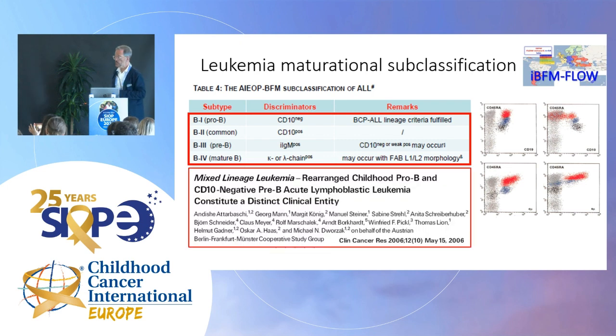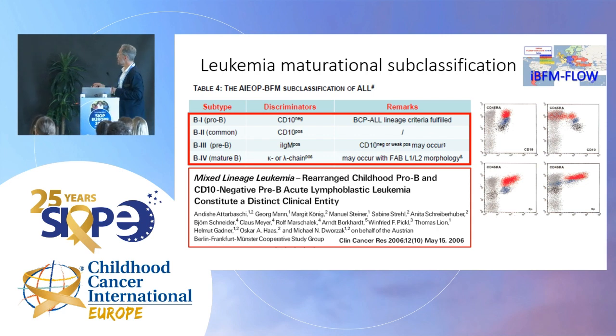Nowadays, it's known that Pro-B is so Pro-B because it's an aberration. It loses, it down-modulates marker expression. It's not like a reduplication of maturational stage. It correlates with MLL or KMT2A rearrangement. Pro-B in most cases, not in all, is actually a genotypic lesion-directing finding you may have. So this is why I present you this, because we are talking about maturational stage classification. In the real world, we are building information on the genotypic lesions behind.